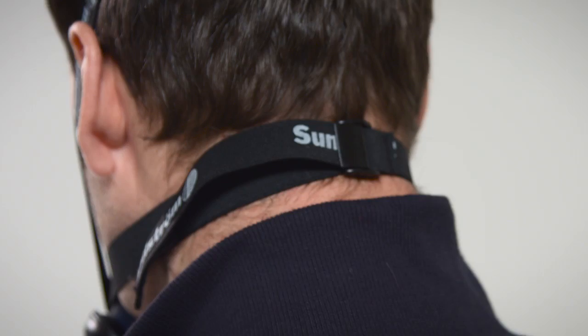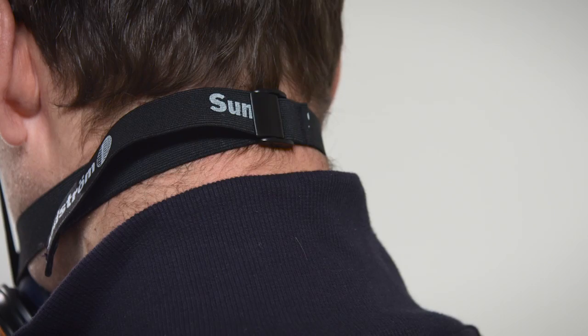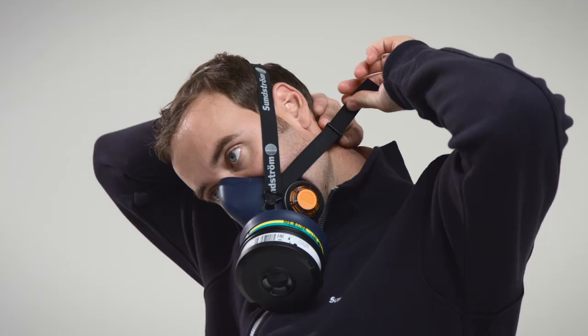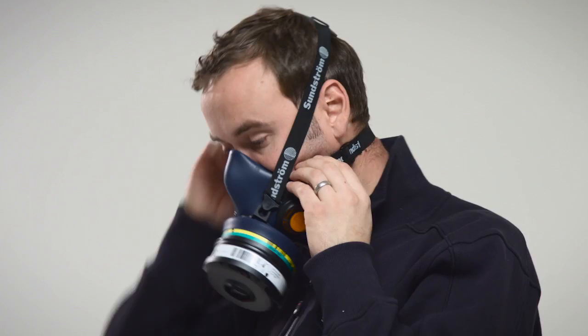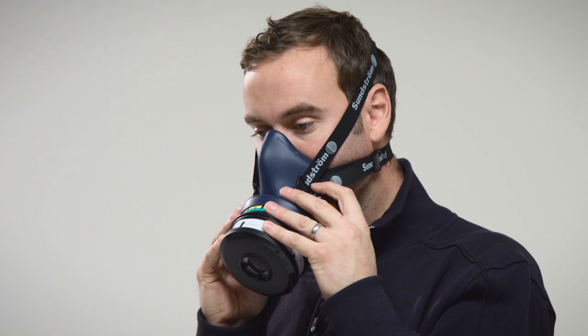Adjusting the harness. Reach behind your neck and grab the free end of the harness strap. Pull the free end away from the neck until the buckle pops open. Pull on the free end of the strap until the respirator seats comfortably on your face. Use your thumb and forefinger to squeeze the buckle shut. Wriggle the respirator until it seats comfortably.